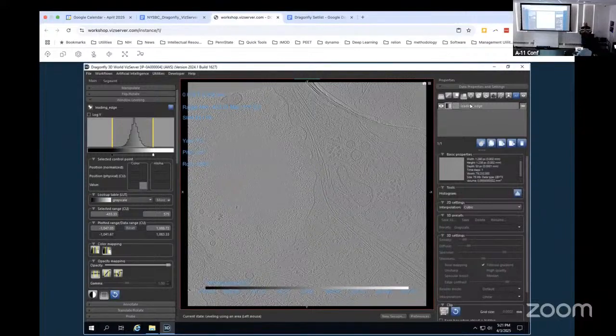Now, Dragonfly does some weird orientation things. Sometimes tomograms that you see in IMOD will flip. Sometimes they don't flip. I never completely figured out the rule. When you're importing these, you can tell it how to transform and translate. Well, actually, I did figure out the rule on my system, but when I got on this instance on the cloud last night, it doesn't work the same way as mine. It's because it's an older version, and I'm not sure.